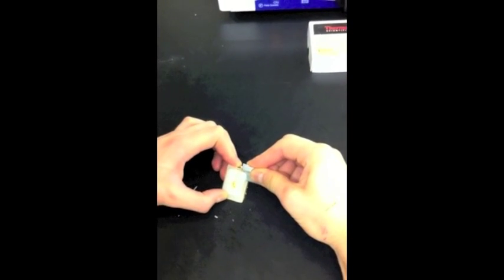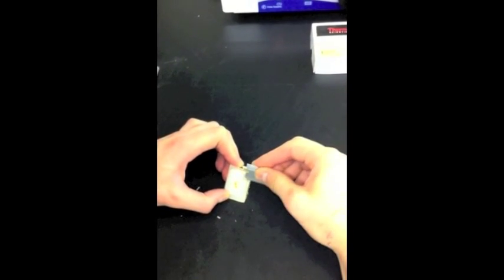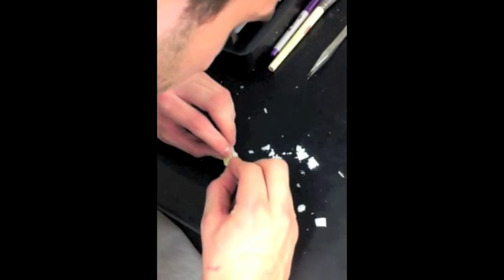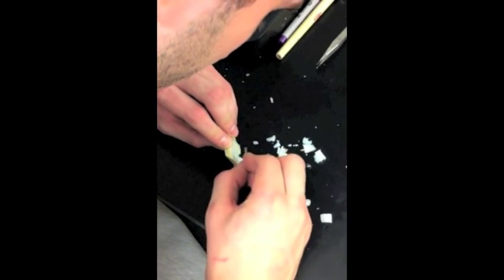Remove the excess paraffin around your sample using both horizontal and vertical cuts. Be careful not to crack the paraffin off of the cartridge.